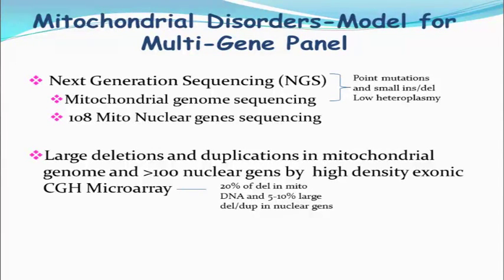The reason for doing this is that the mitochondrial genome is highly polymorphic. A lot of polymorphisms can cause primer site allele dropout. The different primer locations avoid allele dropout in the long-range PCR. And on the left-hand side is the agarose gel showing the PCR products.